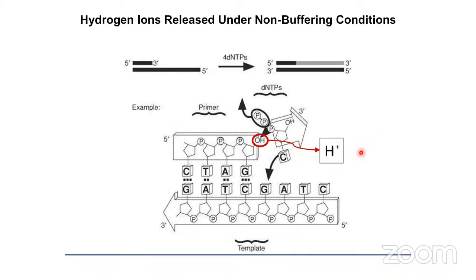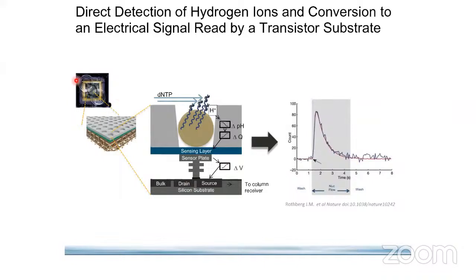So this instrument basically detects this proton ion, which is released during this step, and it converts this chemical energy to electrical energy. This chip has a lot of sensors, where the proton ion is detected by the sensor located below the chip, and it converts the chemical signal to an electrical signal. That's how the instrument gets to know that the sequencing is happening. Now, if Ankit can show the instrument, I'll give you the tour of the instrument.